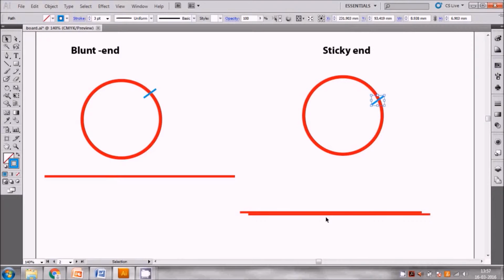So a sticky end means there is some kind of extension after cutting, which you can call the flanking region at the end. I will explain this concept further.